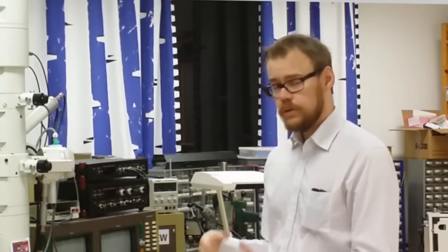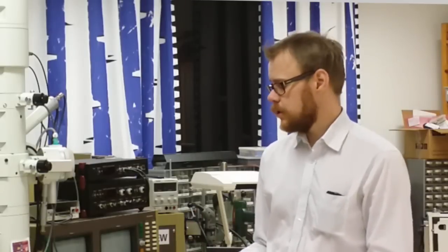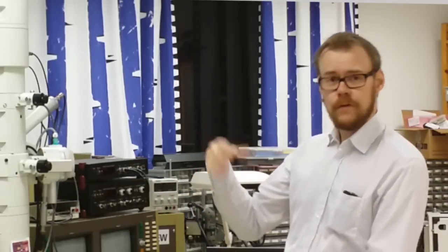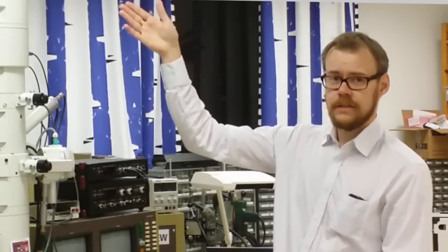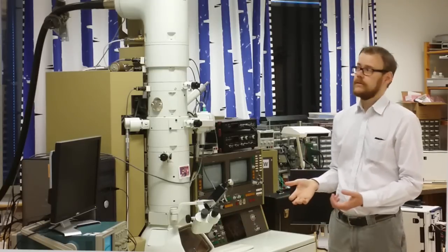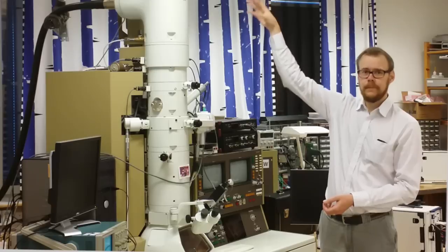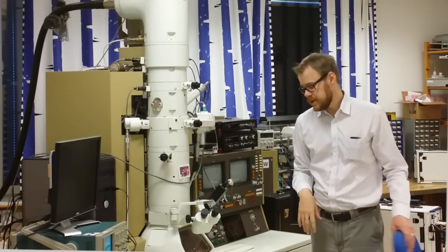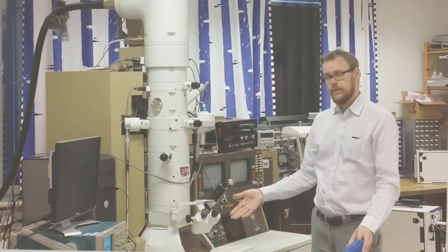If you compare this to a regular light microscope, you know that a regular light microscope has its light source at the bottom and you view from the top. Here it is sort of the reversed case. The source is at the top and you view at the bottom. And that is a practical reason. Because otherwise you would need a ladder to stand up and look on top of here. So now you can sit easily on a chair beneath and study your sample.